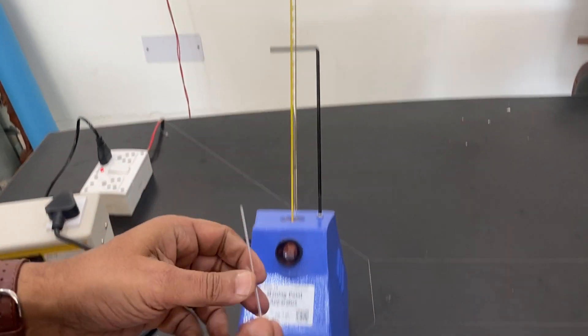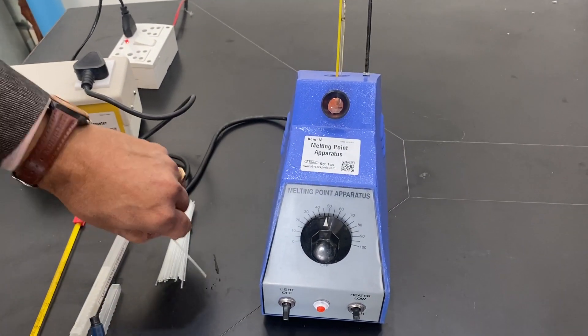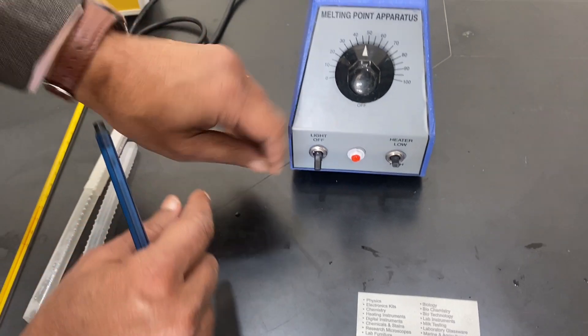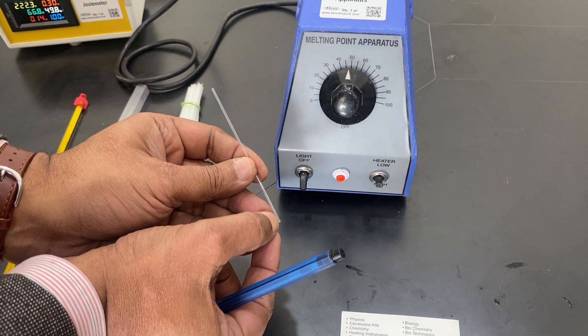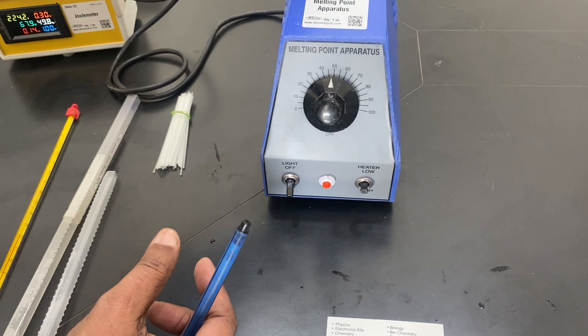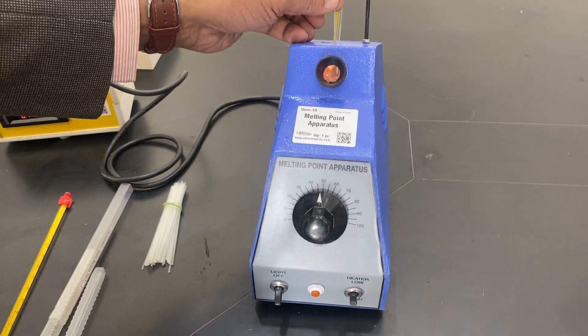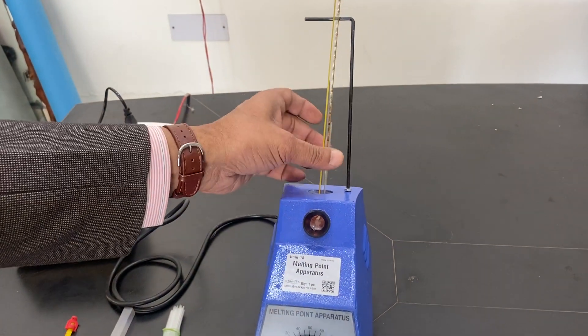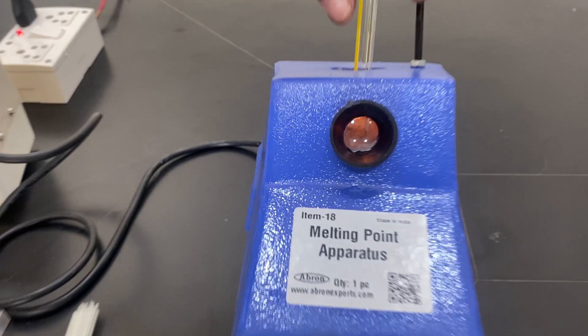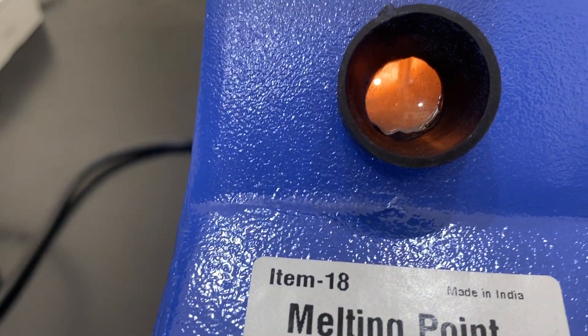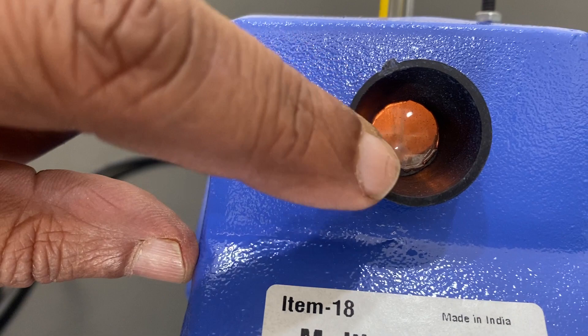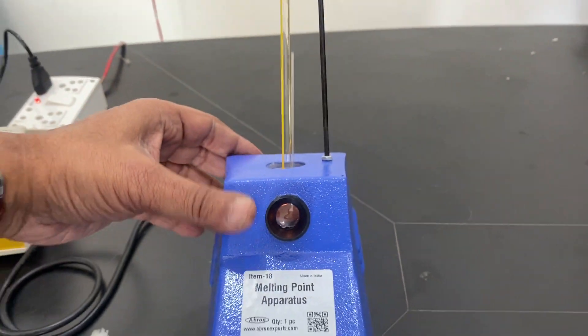When you have to test the sample, seal this with the burner. Fill it with the powder, tap it, fill it, tap it. It should be minimum about half a centimeter to one centimeter. Then you can put the sample inside. You can see inside the sample, these capillaries.